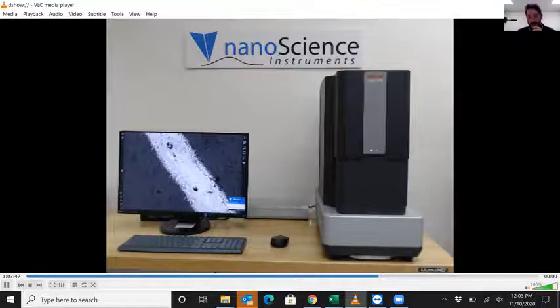So if you think about 1,500 hours, that's several years probably, if you're using it a few hours a day, before you actually need to worry about any maintenance. Whereas with a tungsten source, those typically will die in 50 to 150 hours.